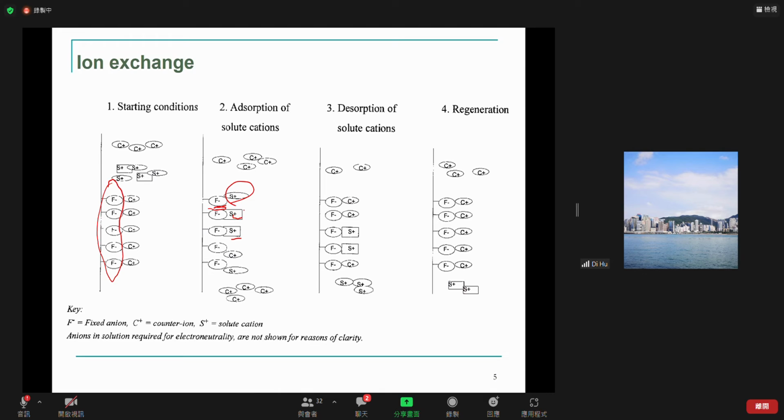Some of them can be more strongly bonded, and some more loosely bonded, with not really strong attraction. So it depends on the different affinity. The more strongly bonded one will definitely elute later, and the more loosely bonded one will elute earlier, right?